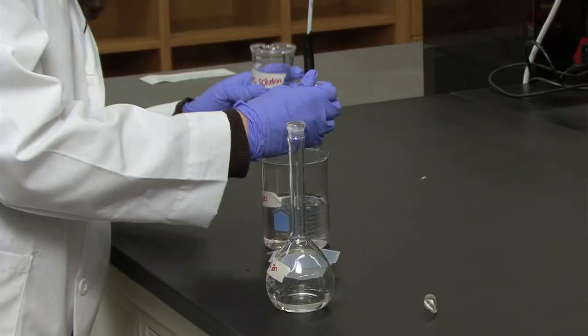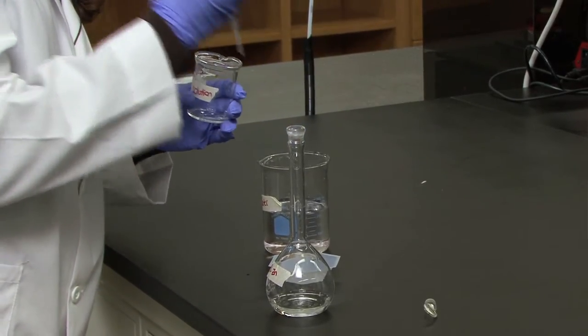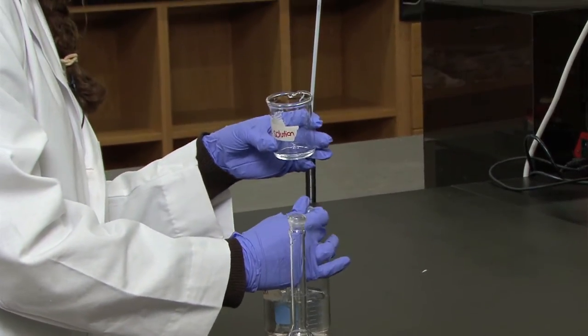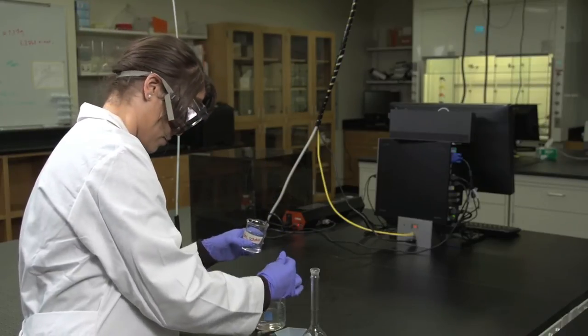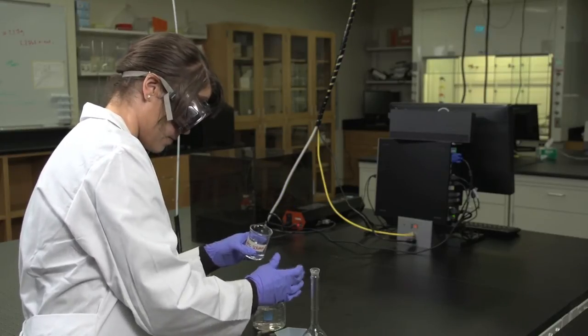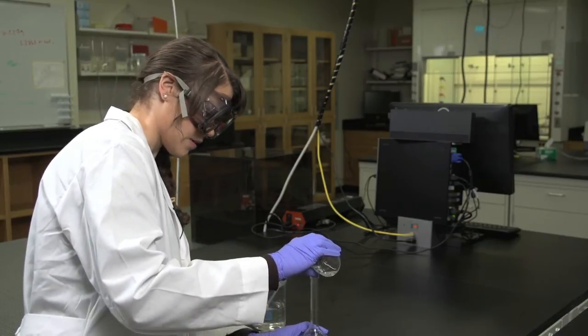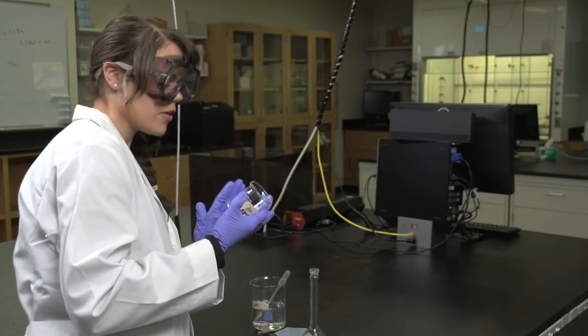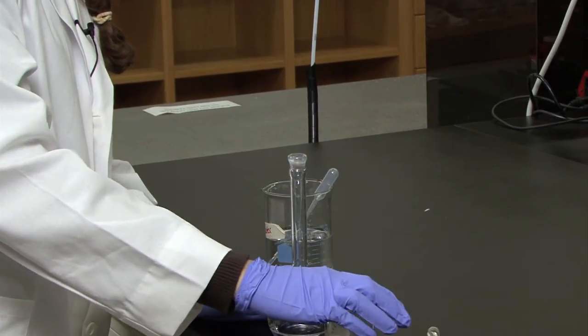I'll just repeat again. You can also swirl it slightly just to make sure you are fully getting all of the zinc. So you would repeat that procedure three more times with the beaker which held the zinc.